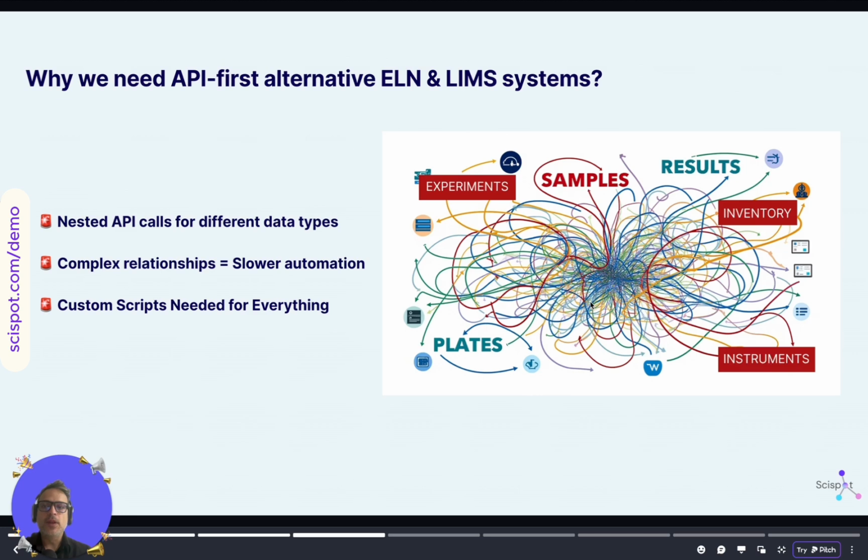And I think one of the things that comes down to is nested API structures as well. Joining sample registry with your asset data is really hard if you have a different schema or custom registries for each of your data points. Joining results with your plate reader data also becomes difficult. Your bioinformatician might be writing custom SQL joins to find different data sets.